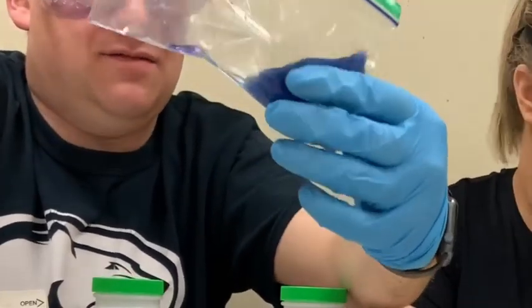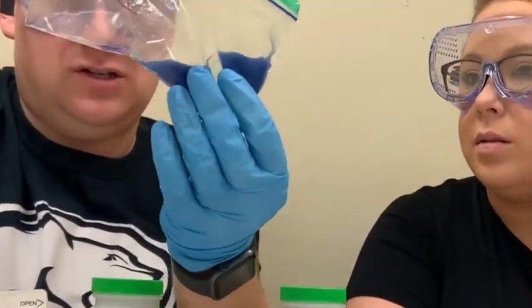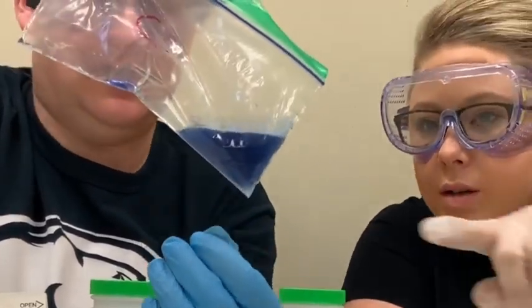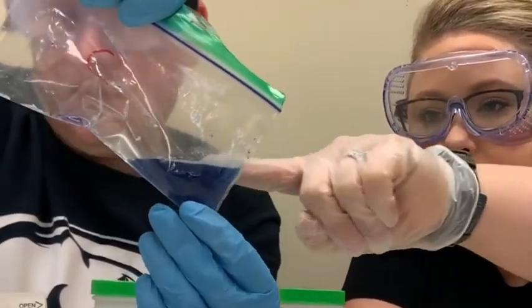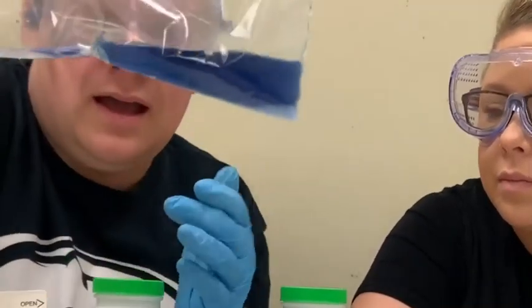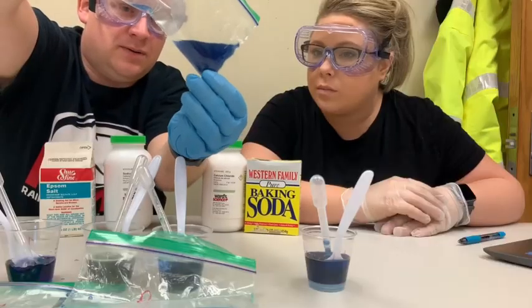And then there's definitely a temperature change. And we feel it. It definitely feels colder. So we had a color change. It changed to a blue. The temperature definitely got colder, so it decreased, because we like to use decrease or increase in science. See some gas forming as there's bubbles up here. It looks kind of like it does in soda when you have the bubbles coming to the top. And then I don't see, oh, there's that part spilling. I don't see any precipitate in here.